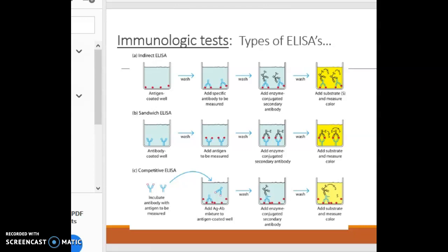For example, oxidation of the compound luminol by addition of hydrogen peroxide and the enzyme horseradish peroxidase produces light, and this light is measured. The advantage of this technique over the standard ELISA is that it enhances the sensitivity. In general, the detection limit can be increased at least tenfold by switching from a chromogenic to a luminogenic substrate.